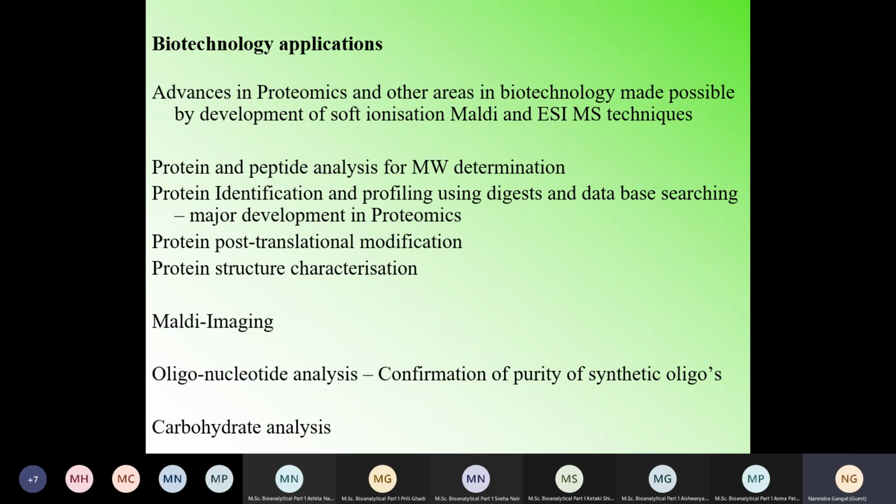My compound of interest becomes MH+, which is a positive ion. As soon as the protonation forms the positive ions, they are extracted toward the mass analyzer portion. They get attracted to the negative lenses, then collimation and other things happen, and they go to the mass analyzer and get analyzed. So this is how MALDI works.